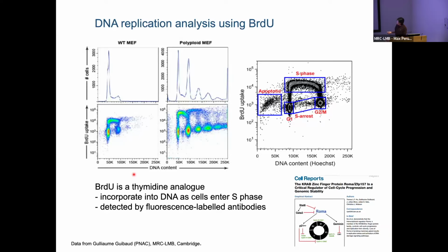So in this paper, Zhang showed, compared to the wild type, beautiful cell cycle S phase in polyploid MEF cells. These MEF cells have an abnormal genome size. They have lost the ability to divide. You can see they are actually accumulating DNA rather than dividing.